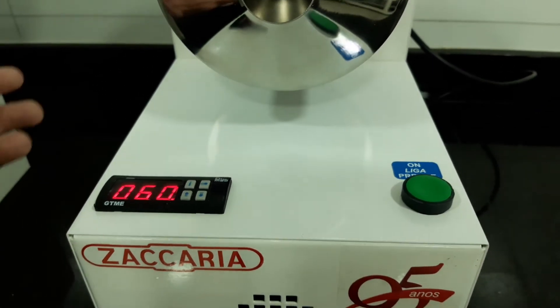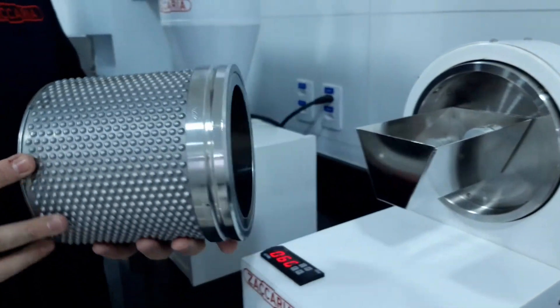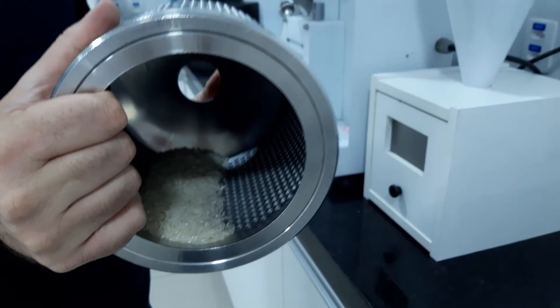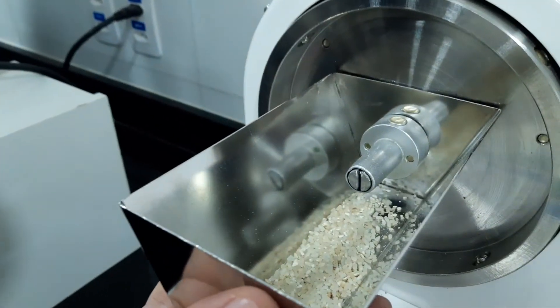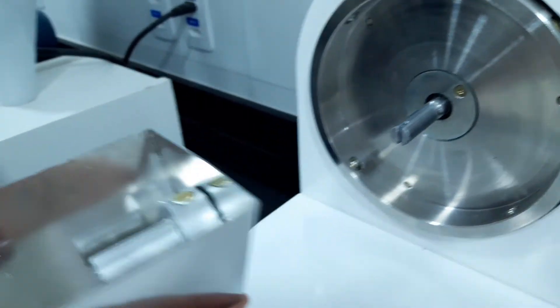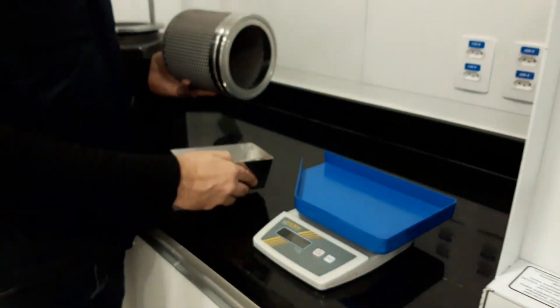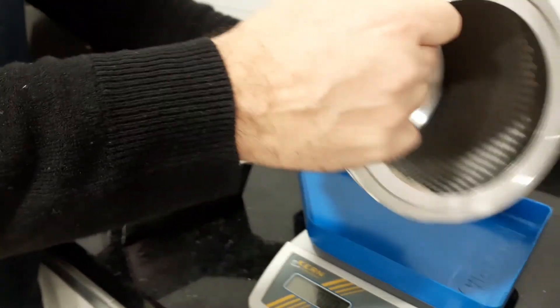When the time is out, the machine stops by itself. We can remove the cylinders. The whole grain stays inside the cylinders, and the broken goes inside of this tray. So this tray we take off, and we will measure the whole grain.